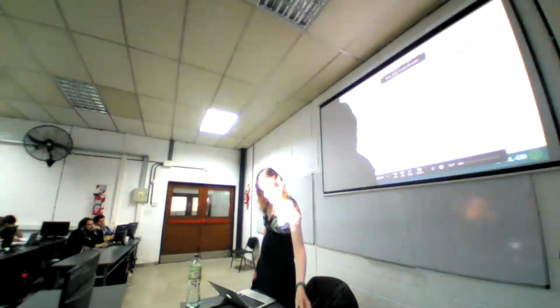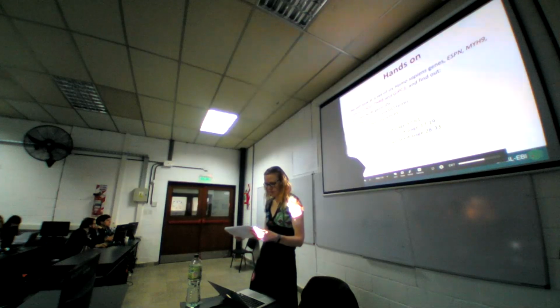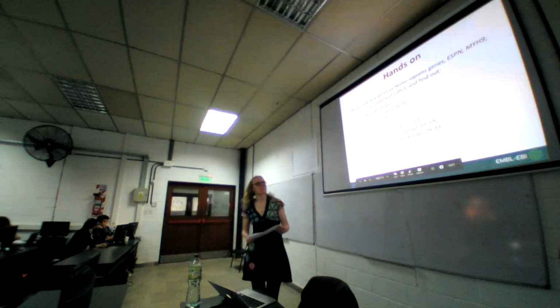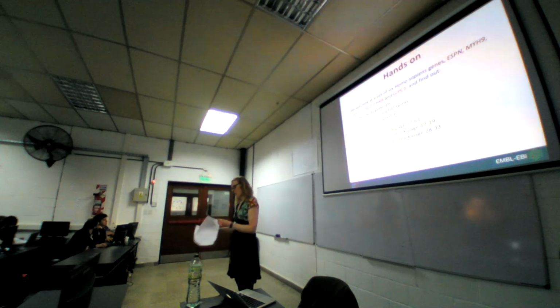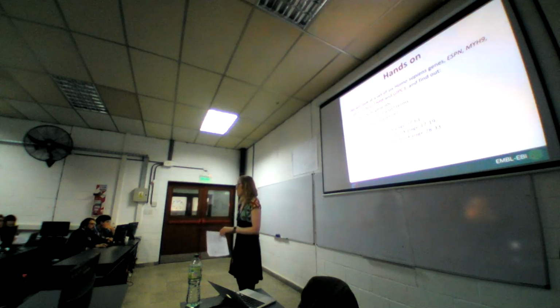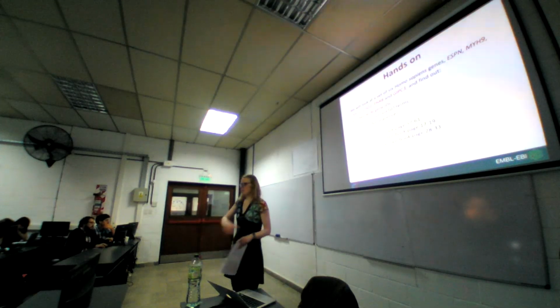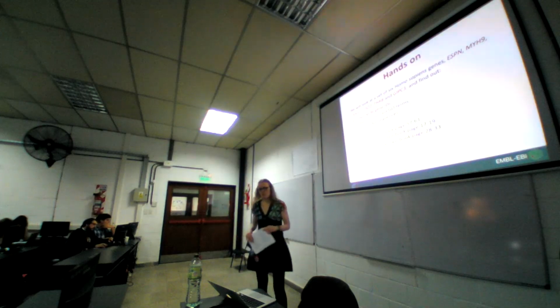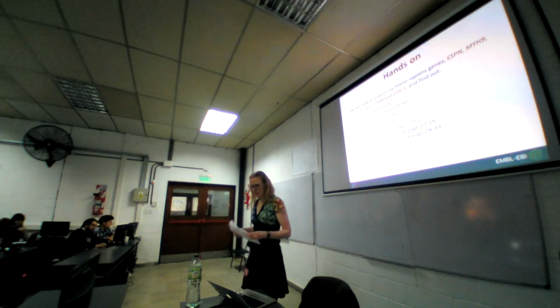There are quite a few exercises for this, which are on page 17 to 19 of your course book. Just to get different types of data with BioMart from Ensembl. Please see what you're most interested in. Some are related to genes, some are related to variants, others to comparative genomics. And yeah, please do 1 or 2 exercises.